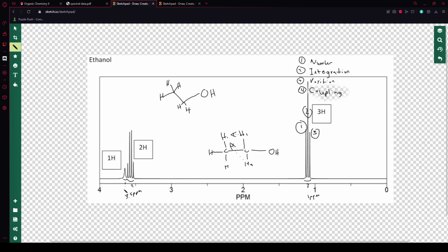And we can repeat this looking at the other groups of peaks. So for this first one, on the far left, there's only one peak, so we say yes, there's a hydrogen here, but it's not coupled with any hydrogens on adjacent carbons. So that's just going to be this one, and then this one on the alcohol, to be clear.